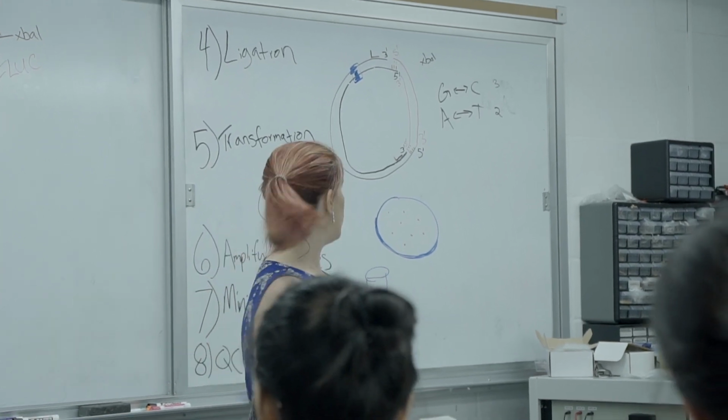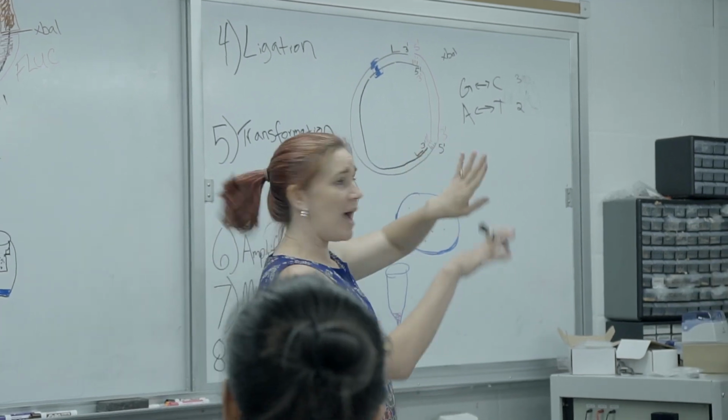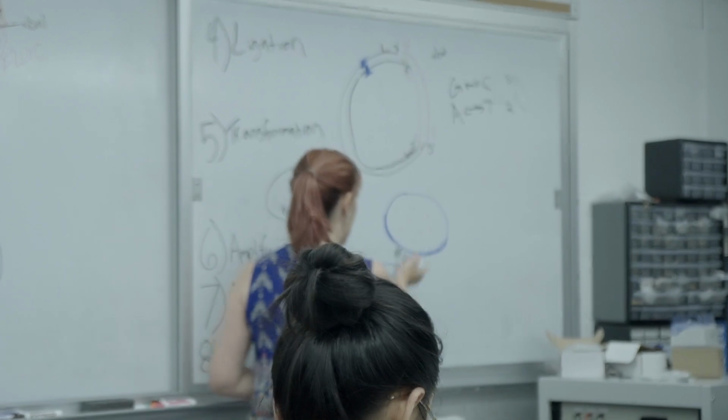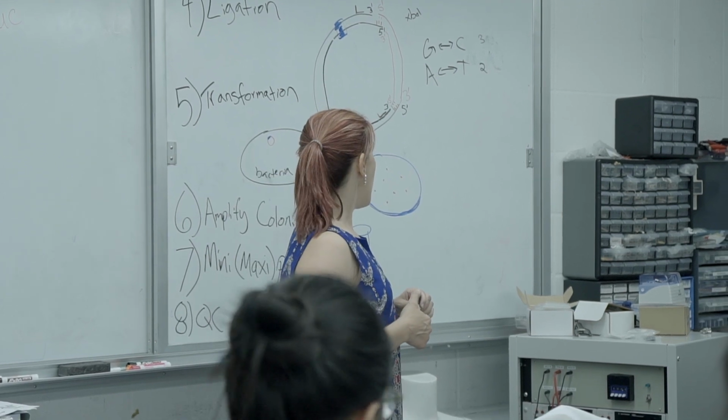There are computer programs, so you don't have to sit there by hand, and I'll line them up. If they line up, I know it worked. Say it lined up for number 1. Then I will take number 1, and that's what I'll use to make my virus, or make even more, a bigger stock.